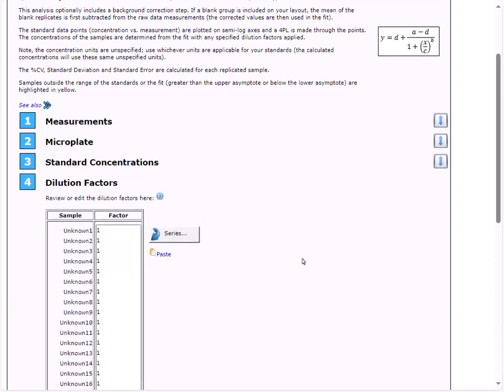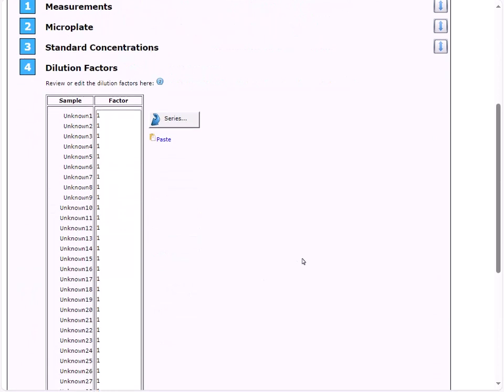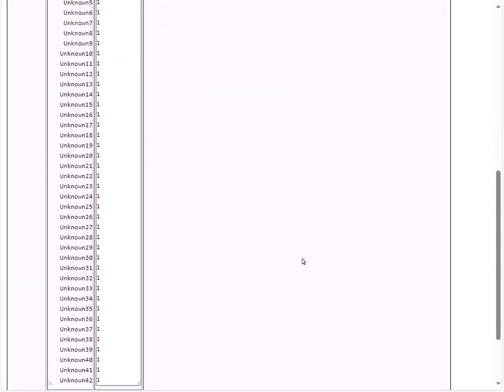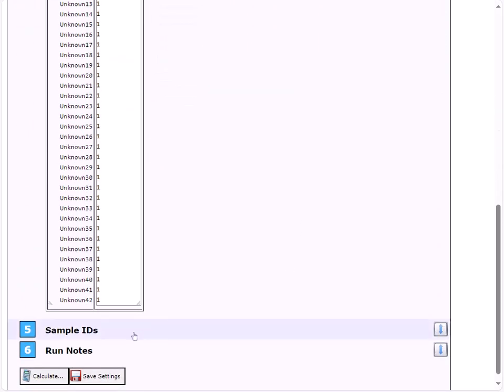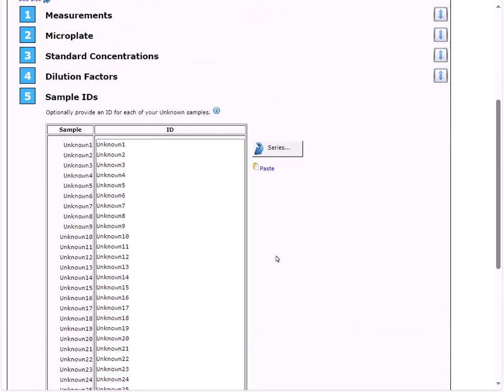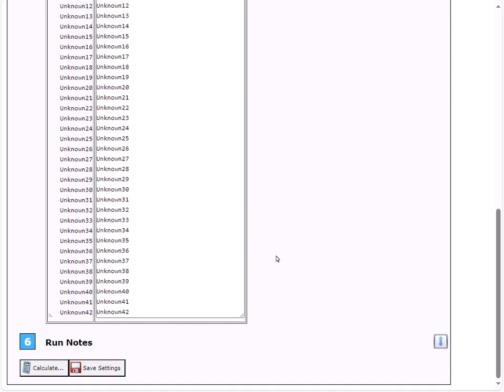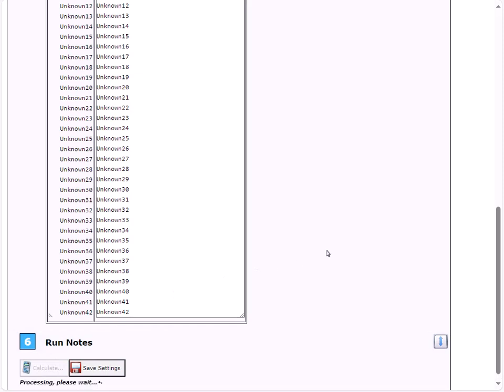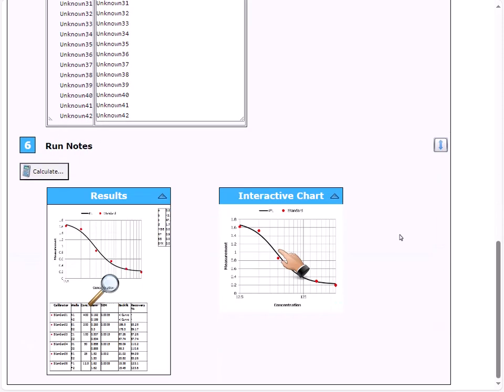Next, we can specify any applicable dilution factors for our unknown samples and add sample IDs if necessary. Once we have all the settings configured for our assay, we can press calculate to calculate our results. Once our calculations are complete, we can view the interactive curve chart to display the curve in greater detail.